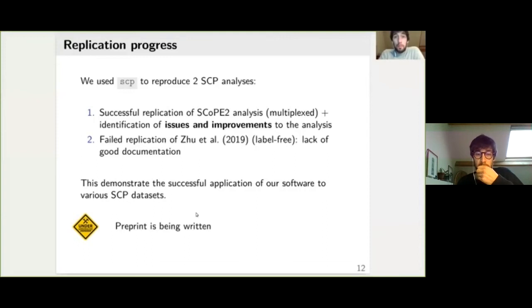tried reproducing another data set. It's a technical detail, but this data set was acquired with a label-free quantification protocol. And in this case, we actually could not replicate the results. But I want to say this is not a limitation in our software. This is rather because a lack of good documentation did not allow us to do the same thing as they did.